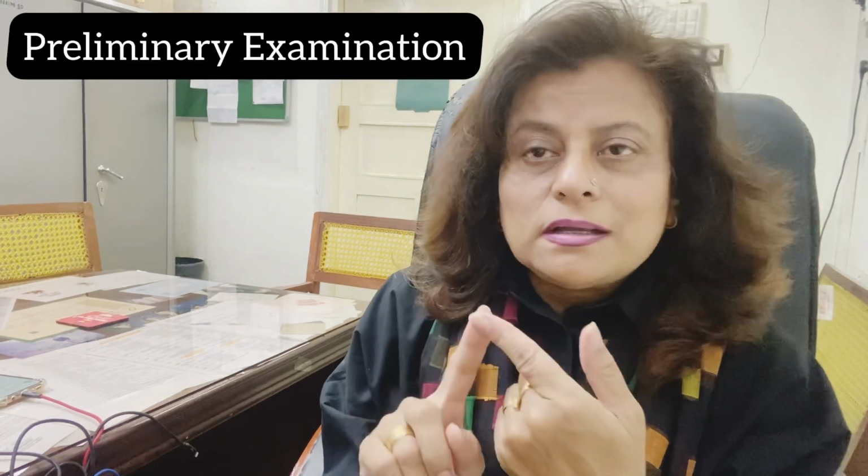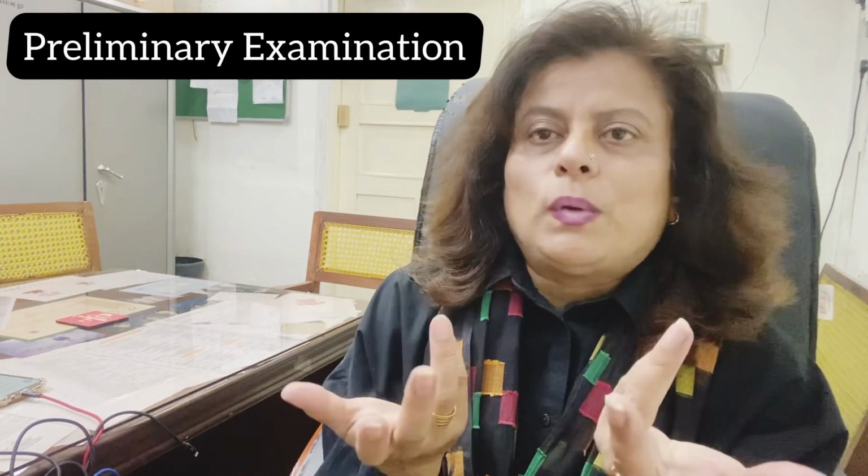So I was telling you about the 4 steps. These are the 4 steps which you will perform in the lab, right? And the first step is preliminary examination. That tells you about the nature of your organic compound, the state which it is in, right? If it's in the liquid state, if it's in the solid state, if it's an amorphous powder, if it is crystalline, whatever its state is, you will see the state, and then you will smell it, and you will check its smell, and that is called odor.